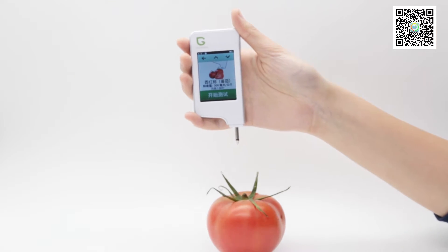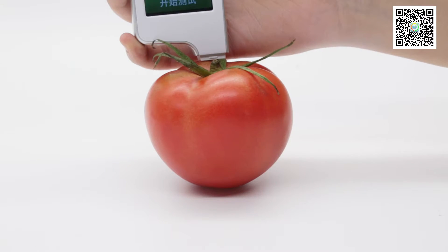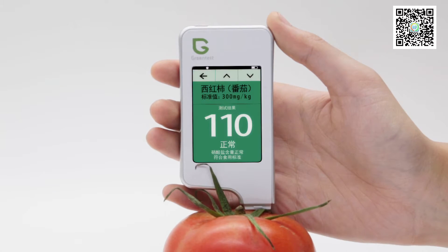Use the probe to penetrate the skin of the chosen fruits or vegetables. Press start and wait for a few seconds. The nitrate content of the tested fruits or vegetables will be shown on the screen of the Green Test.